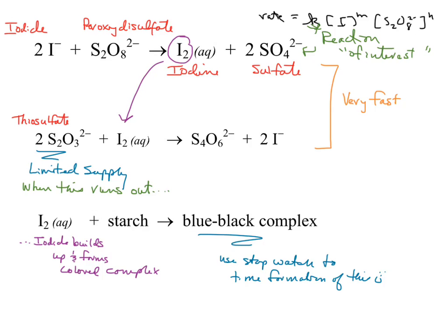Let's see. Let's just go ahead and go to the experimental section. For me, it's on 243. Okay. So in here, we definitely have 2 groups going on, right? Here are what you need for one set of trials. So you can see that basically you are going to get a pair of solutions that somebody's going to have a stopwatch ready. You're going to go over to a 50 ml beaker that's on a white piece of paper, pour them together, start the stopwatch, and look for that blue color.